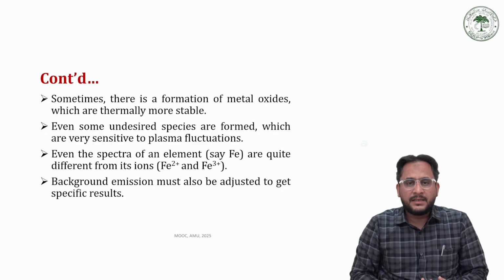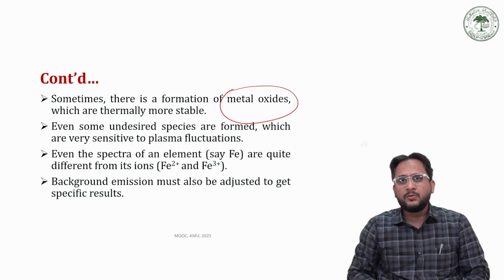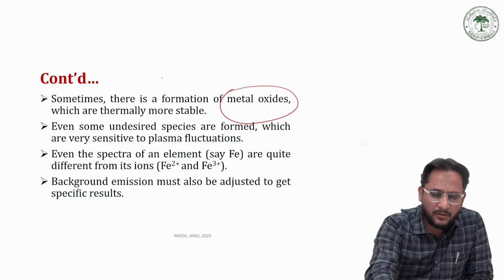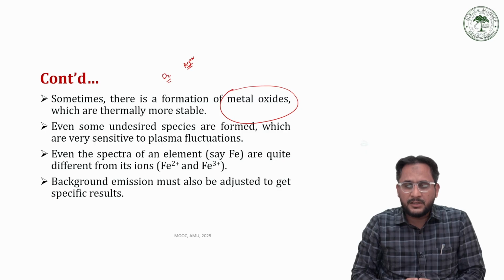Sometimes, as I said, there is a formation of metal oxide. However, in case of ICP, there are very low chances of formation of metal oxides, for two reasons. First of all, we are not using oxygen gas in this particular case. We are making the aerosol with the help of inert argon gas. So no oxygen or air is involved in this study, so the possibility of metal oxides is minimum.